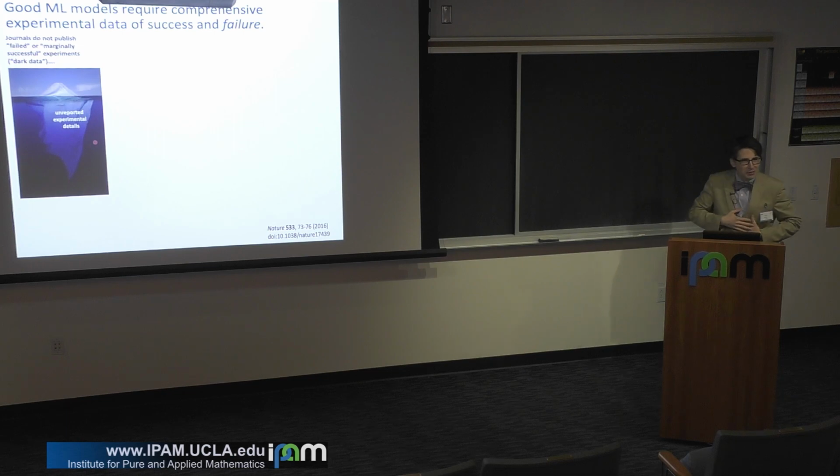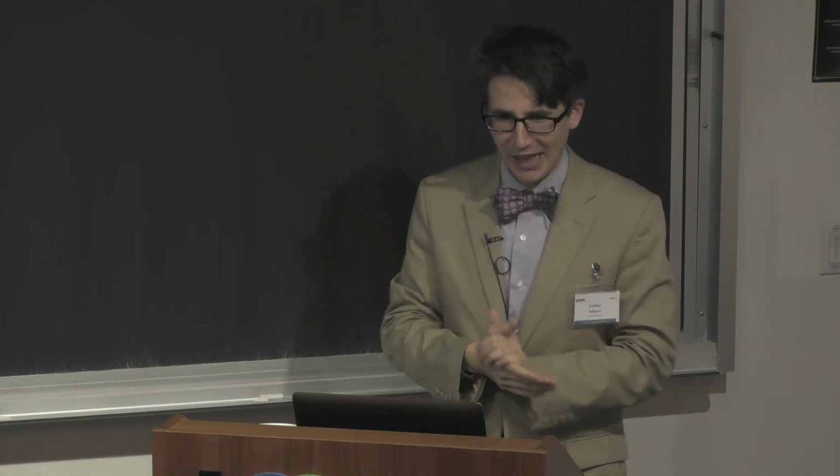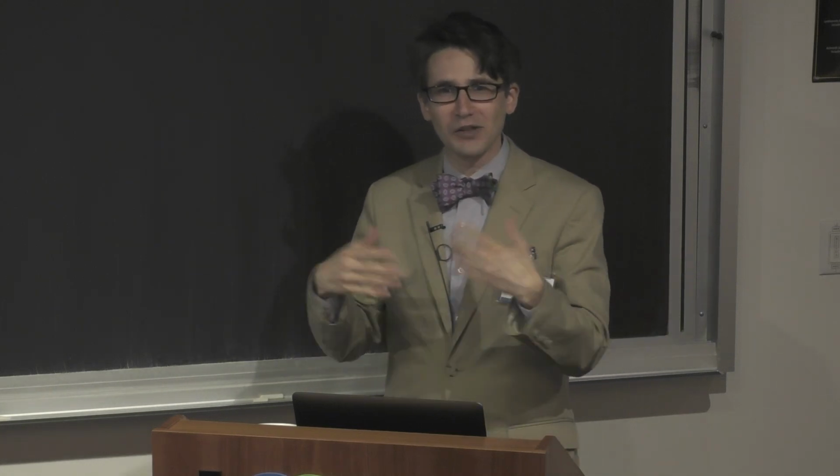And so I'm always jealous of the astrophysicists. They have these great things like dark matter and dark energy. And so I like to refer to these as the dark reactions, right? Or the dark data. But really just think about it as all those unreported experimental details. Now, the thing is, laboratory scientists are actually pretty careful. They do write these things down in laboratory notebooks.